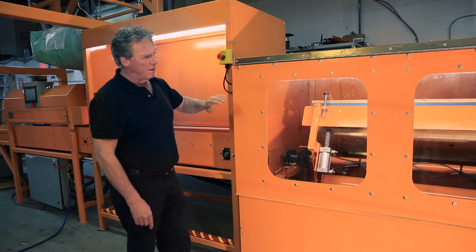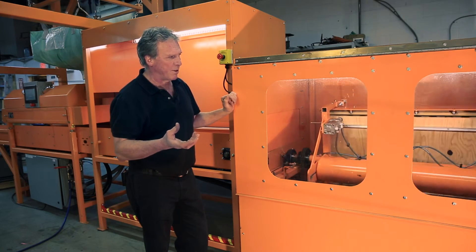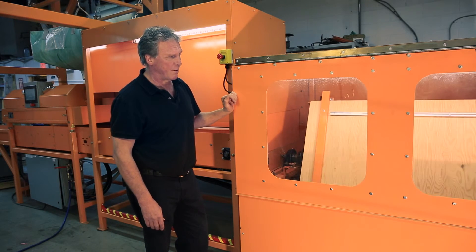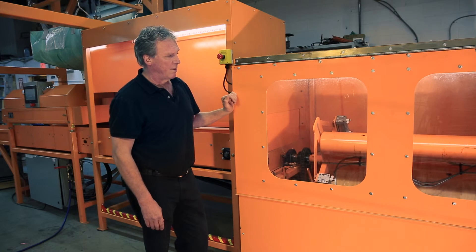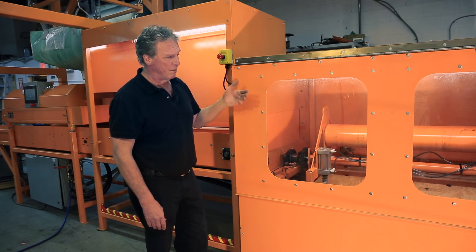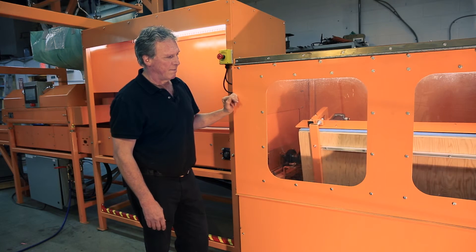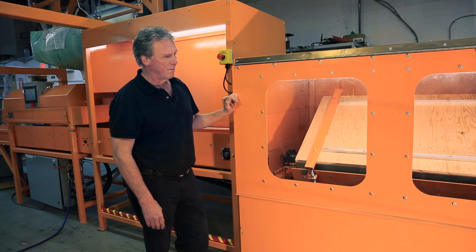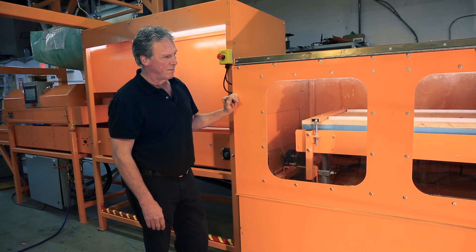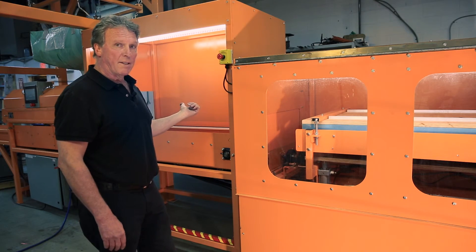If you were to push the e-stop — even if the machine was upside down — it would not dump the crucibles. It will securely retain them in position until the platform is in the level position to prevent any spillage. The machine is now coming back at slow speed to level, then it will lower the platform and you can take out the crucible tray. It retracts and now you can take the load out of either end of the machine.